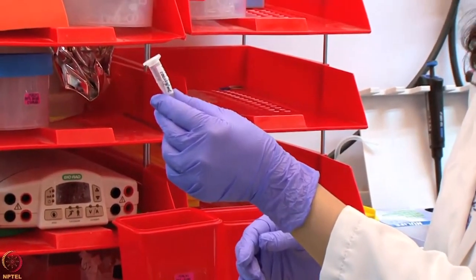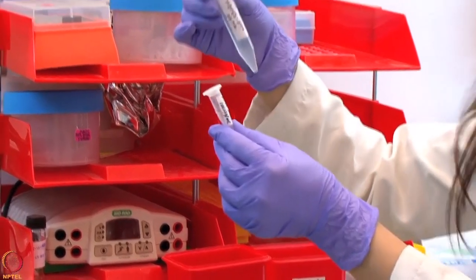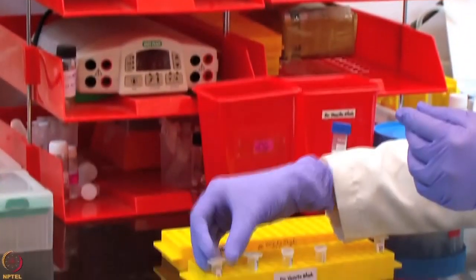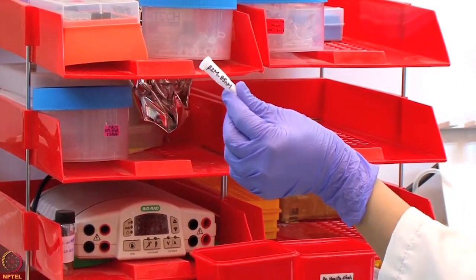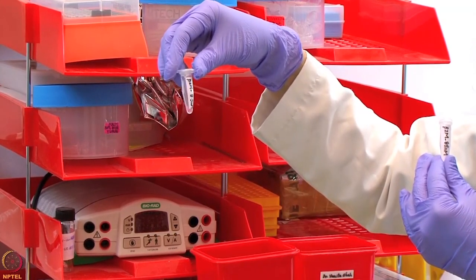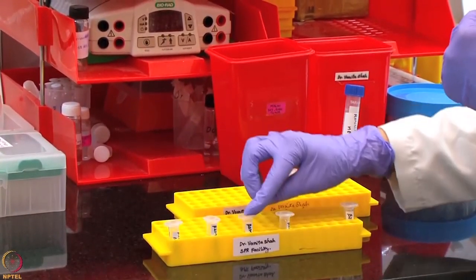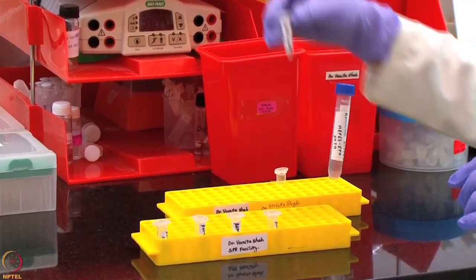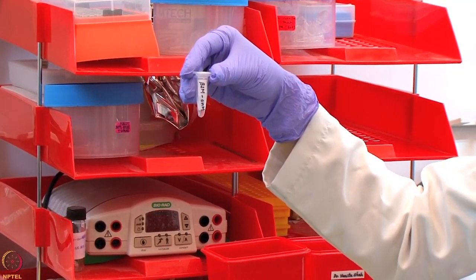We will dilute the stock solution of protein, that is 100 microgram per ml, in the running buffer HBS-EP plus to prepare 100 microliter of three different concentrations, that is 85 nanomolar, 42.5 nanomolar and 8.5 nanomolar, which are referred to as high, medium and low concentrations in the experiment. We will also include a 0 nanomolar concentration in the experiment, which will be nothing but the running buffer.